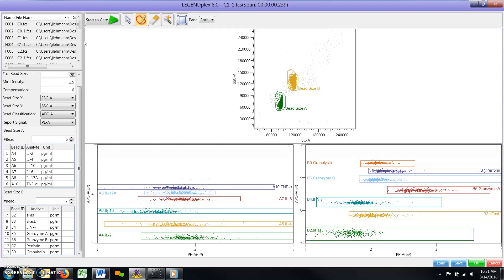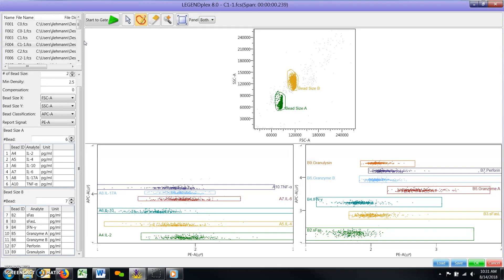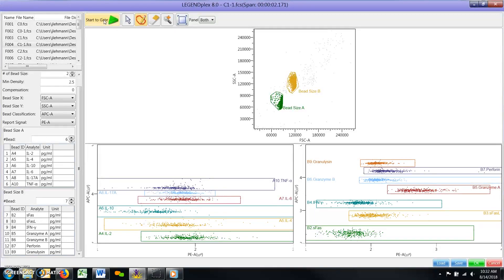If you feel confident in your cytometer setup, you can use the software's auto-gating function to apply gates instead of manually drawing them yourself. This is accomplished by clicking the green start to gate icon found at the top of the window when you are ready to start gating. The software will then apply gates, which will be displayed on the scatter plots.